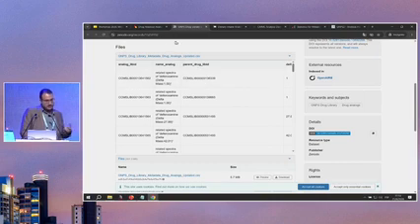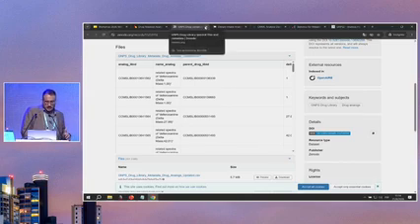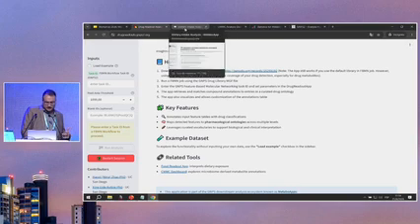It's going to be similar for all the other tools. Just for the drug library specifically, the curation of these MS spectra is more straightforward. So you already have all this information on the tools and the compounds that are present.